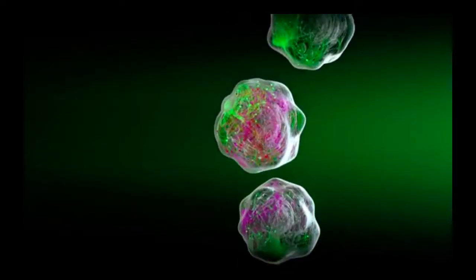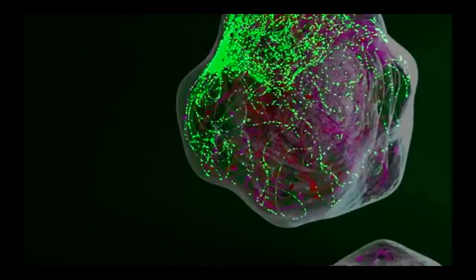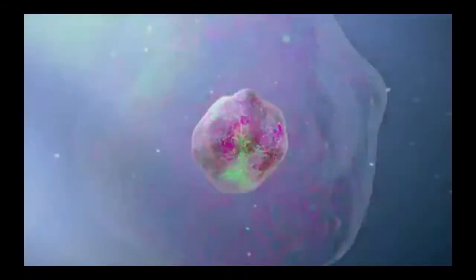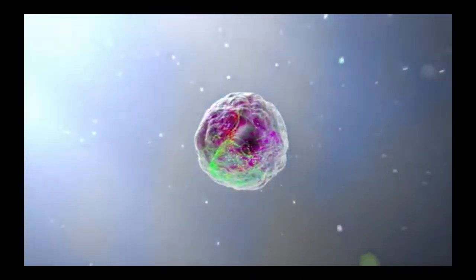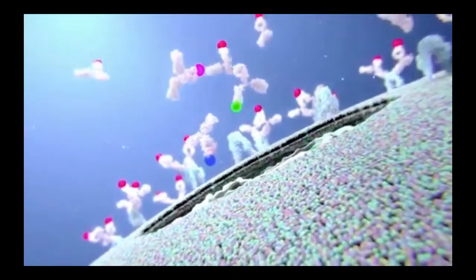Flow cytometry is a laser-based technology widely used to phenotype cells using antibodies directed against surface markers. It can also allow simultaneous analysis of multiple intracellular targets using antibodies that detect signaling proteins, their post-translational modifications, epigenetic modifications, and downstream transcription factors. The first step of intracellular flow cytometry is fixation of the cells using formaldehyde, which immobilizes proteins and preserves transient signaling events. Cells are then permeabilized with methanol or detergent, allowing antibodies to access the intracellular space.